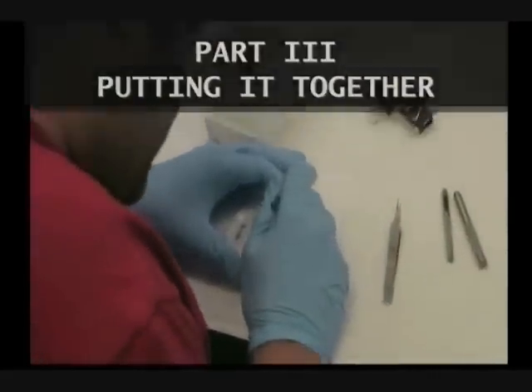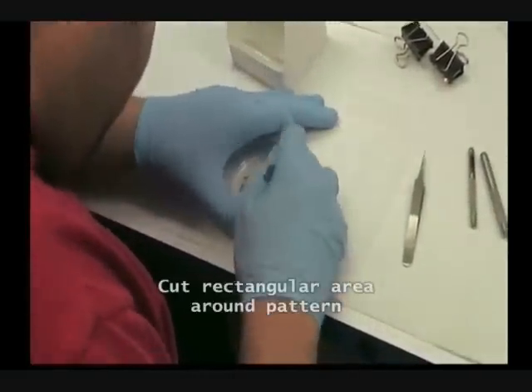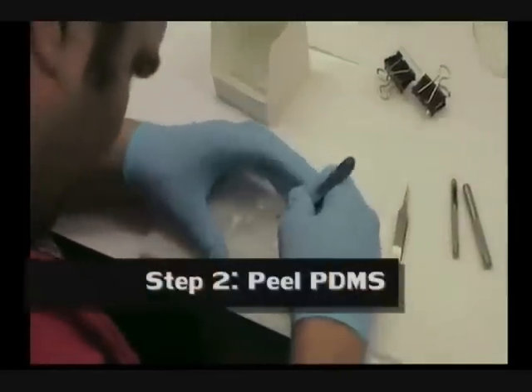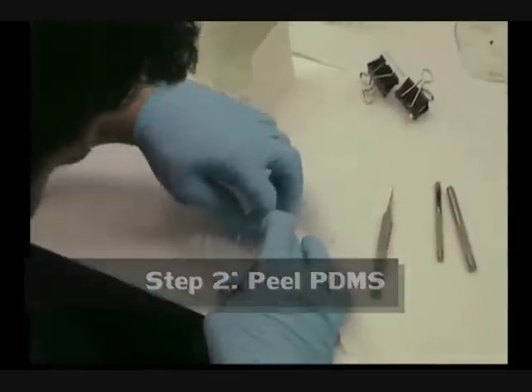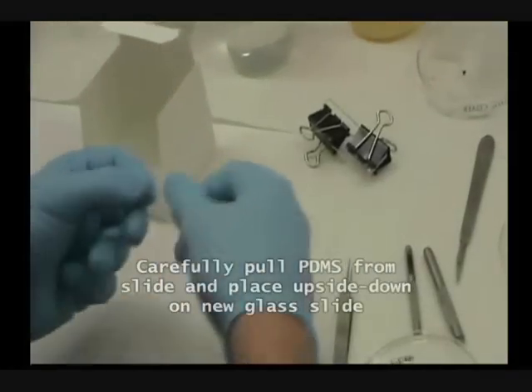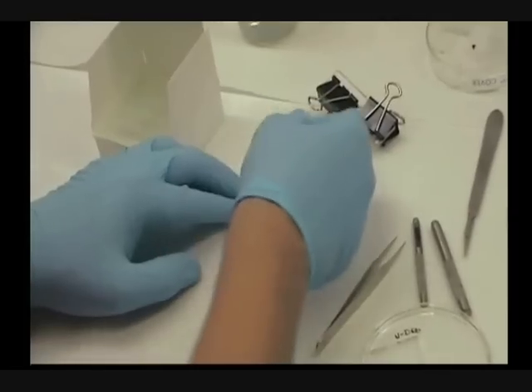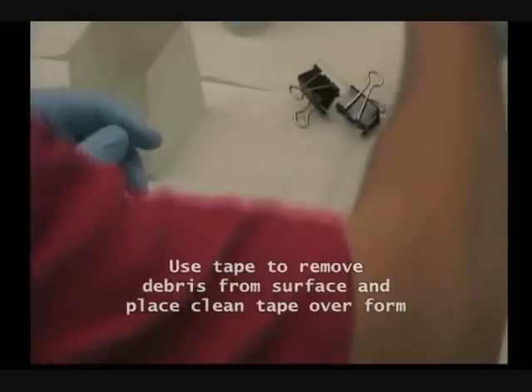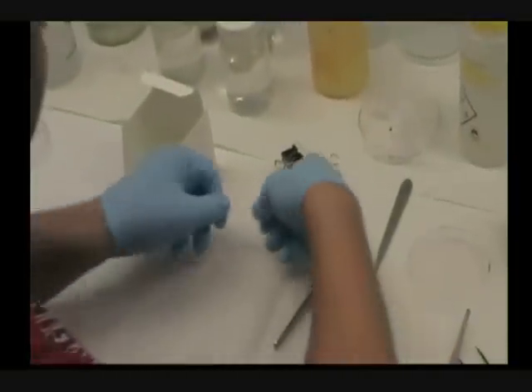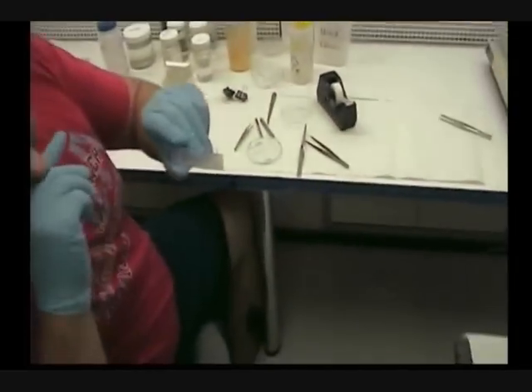I'm gonna cut the PDMS. Now you can't see the pattern.